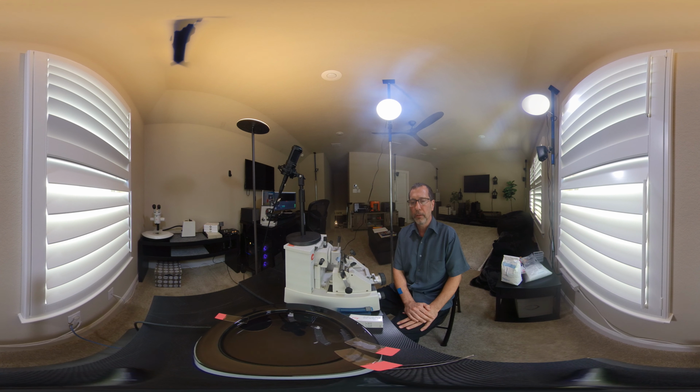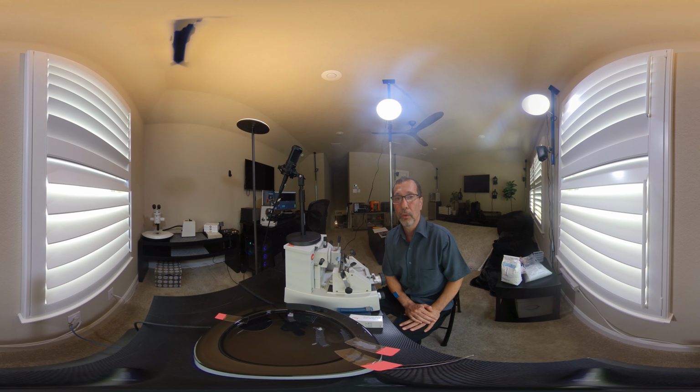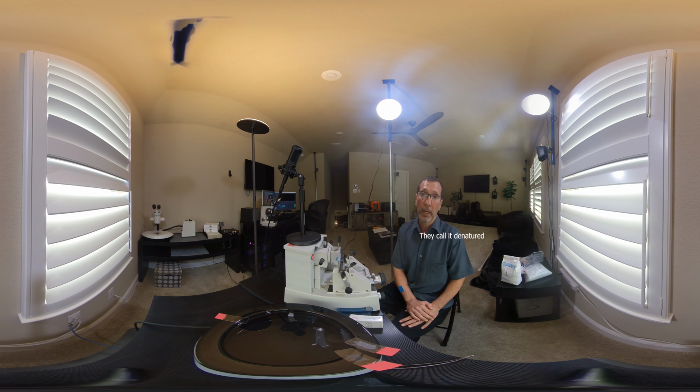And paraffin that's very low in melting point is useful in that there are tissue types that don't survive well in paraffin that's at a melting point of 60. The downside to that is softer paraffins need to be cut thicker.